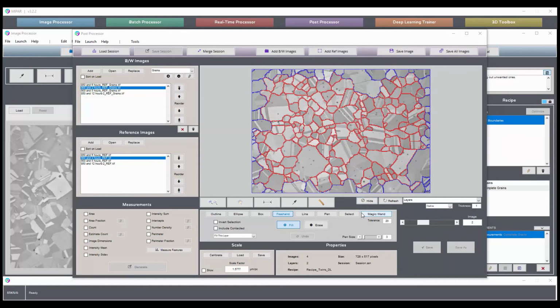Of course, the engine is only going to learn what you provide it. So we recommend that you show it extremes if you have very different microstructural cases, different lighting conditions, prep conditions. Make sure that it is aware of the potential variation it can see. Again, that can happen iteratively over time.